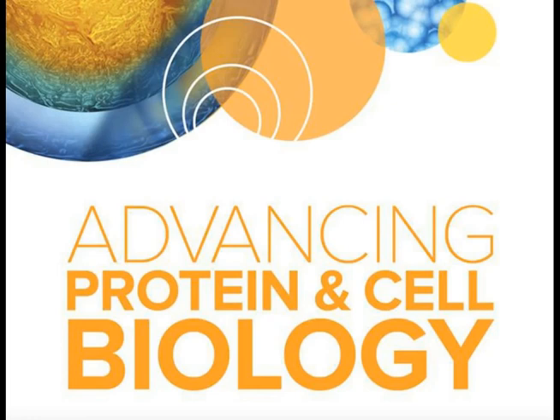We usually keep the plates back in the incubator during these 2 hours, and with the dyes which we use, it's sufficient to penetrate inside spheroids. And we don't wash the dye out, so we just image it directly. This confocal system has very nice background rejection, so it's not a problem at all.